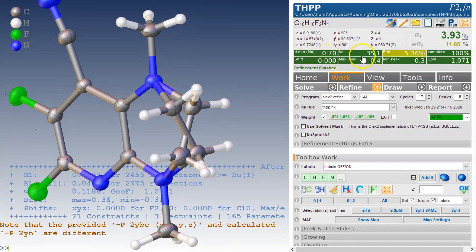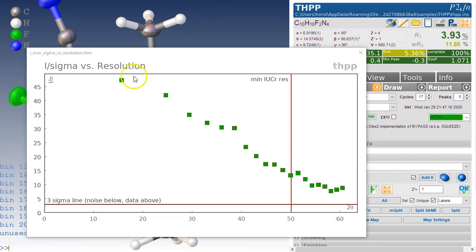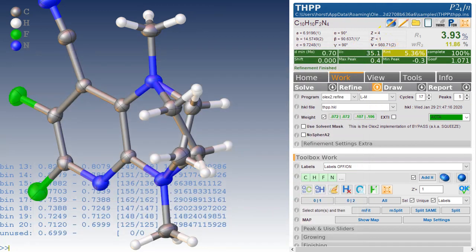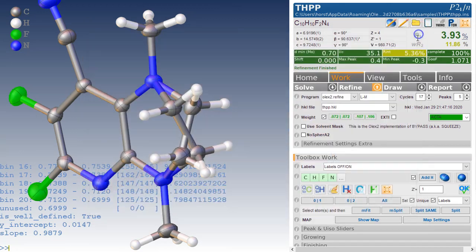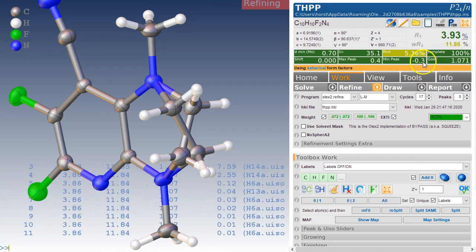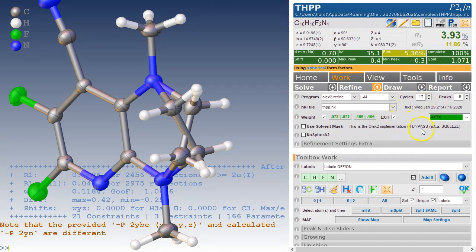We might want to look at the I over sigma plot. That's always an important thing. We should have done this first. And what we see is it's nice and strong all the way out to 60 degrees. So there is no reason to cut any data here because that's all good, valid data. Let's have a quick check at outliers. It's the plot of the F-obs versus F-calc. And with a bit of imagination, this is maybe curved this way. So there might be a little bit of extinction. So we tick this box and hit refine again and see whether we get a value that makes sense.